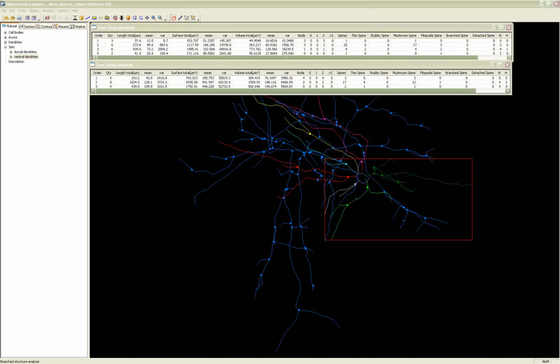There's a question about whether or not you can identify the dendrites and analyze them without identifying the cell body. If you are only interested in the dendrites, you don't actually have to trace the cell body, although I would recommend that you do so. A single simple contour that represents the cell body is often very helpful. The data analysis that you can get is worth the effort, I think.